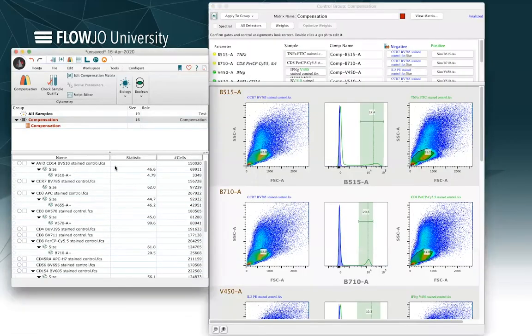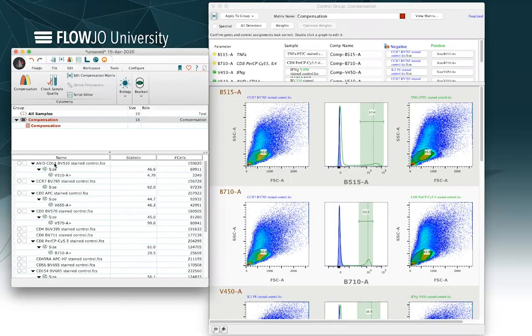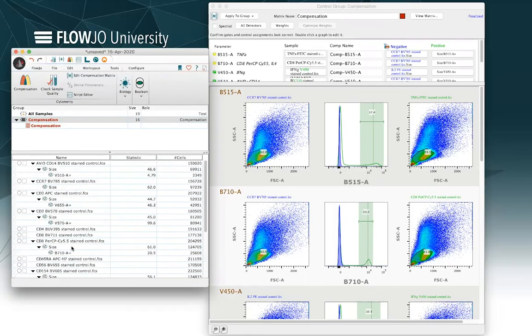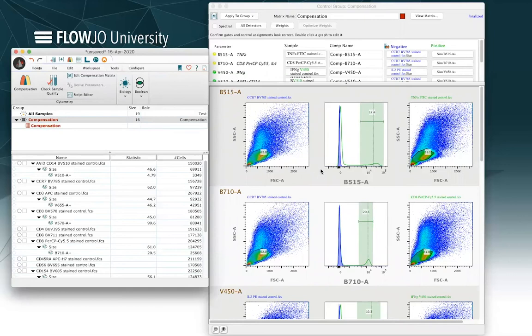What that's going to trigger is a whole set of calculations in the background whereby FlowJo tries to identify the size population on the basis of forward scatter versus side scatter for any single stain controls that it finds in the compensation group, as well as for our unstained control if it's going to utilize the unstained control going forward. So in this case it looks like we're actually using a negative peak and not the unstained control, and that can be fine.